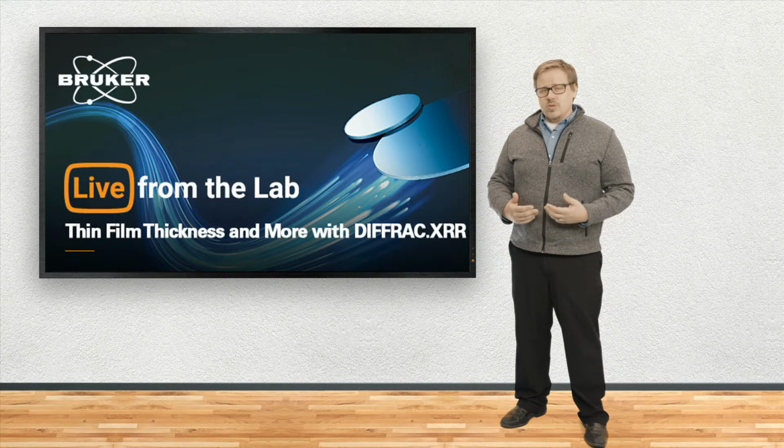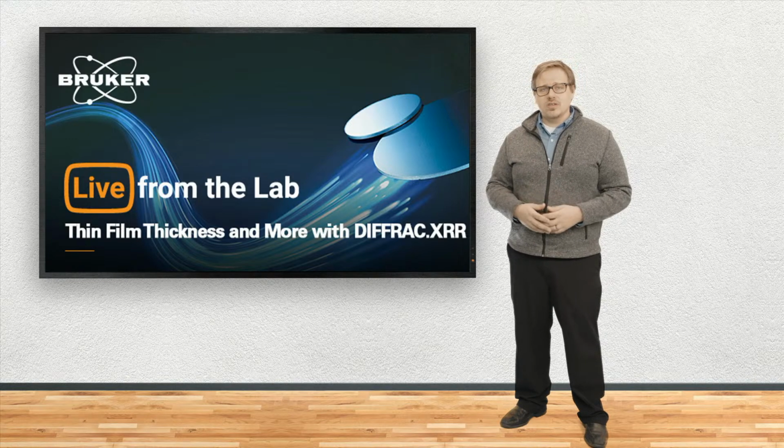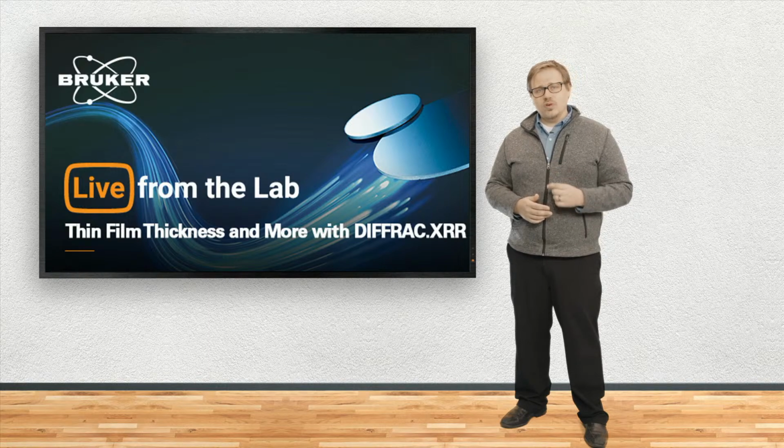Now, in order to learn a little bit more about X-ray reflectometry and how it can help us to understand thin films, we're going to see it in action today. We're going to do some actual refinements using DIFFRAC.XRR. That's a software that's been around, but we just had a new release of it. And actually see how we can do these refinements. So with that, let's go over and see it in action.